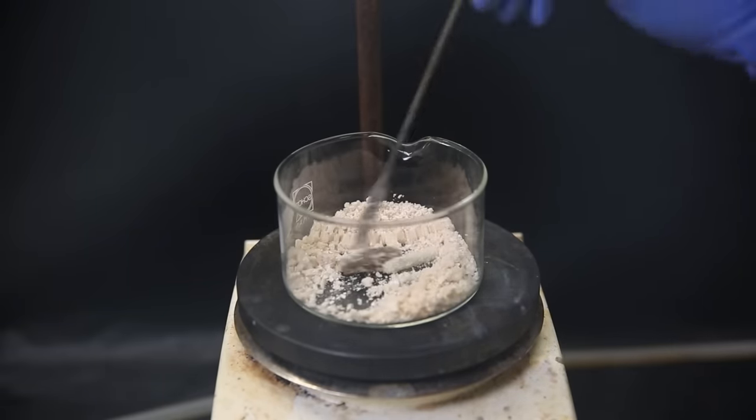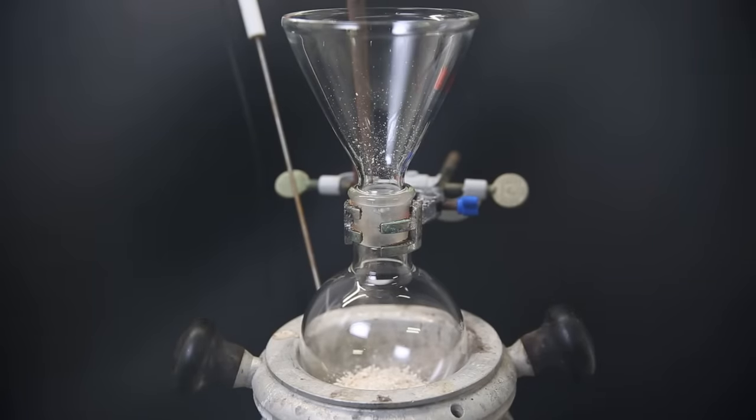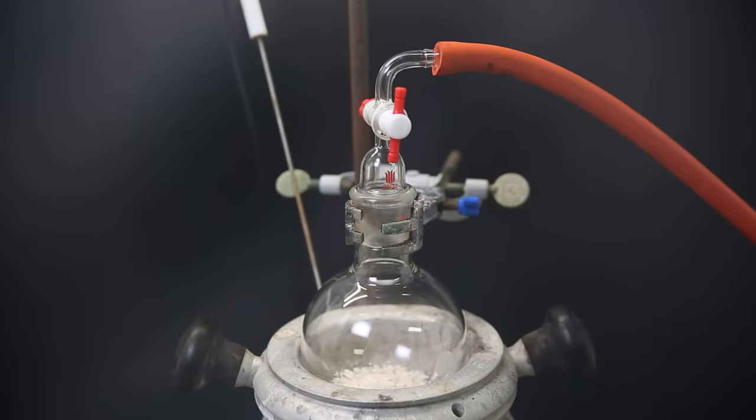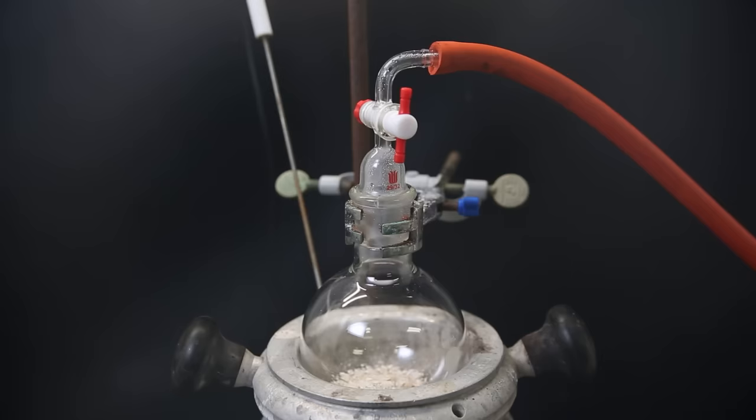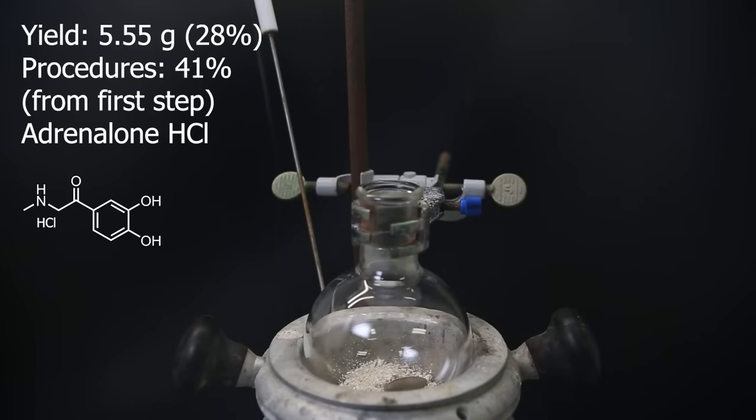Now this solid is still a bit wet and I want to know the yield, so I move it all to a flask. I then heat it to 60°C and pull a vacuum. I left it overnight and after that it should have pulled out all of the solvents. The yield of the dry adrenaline hydrochloride turned out to be 5.5 grams or 28%, which is lower than the combined yields of the procedures I was following, but that is pretty much expected.